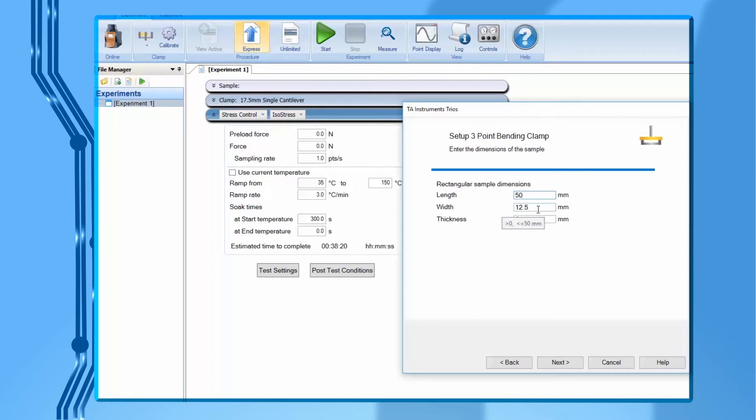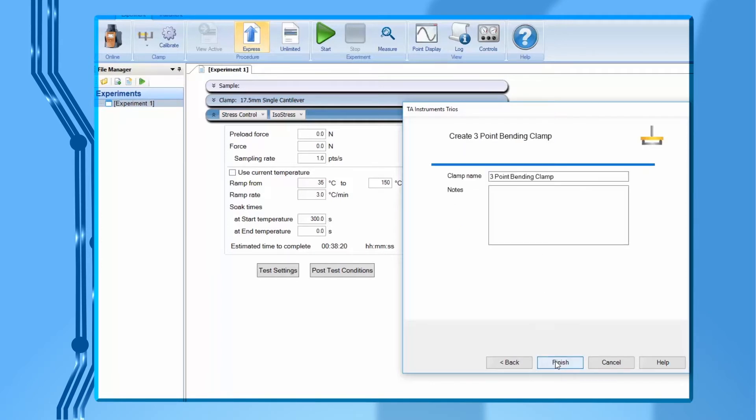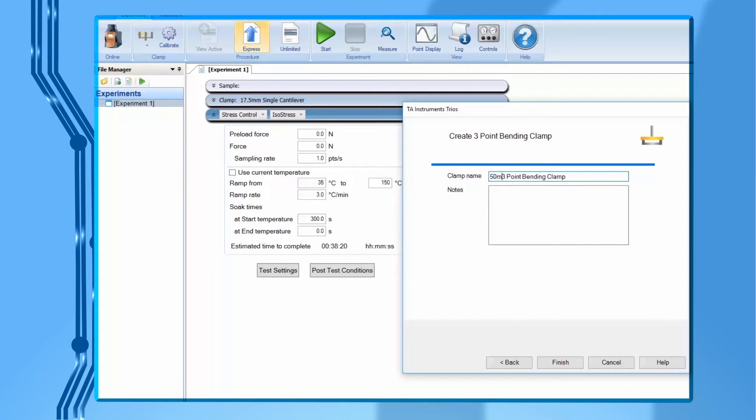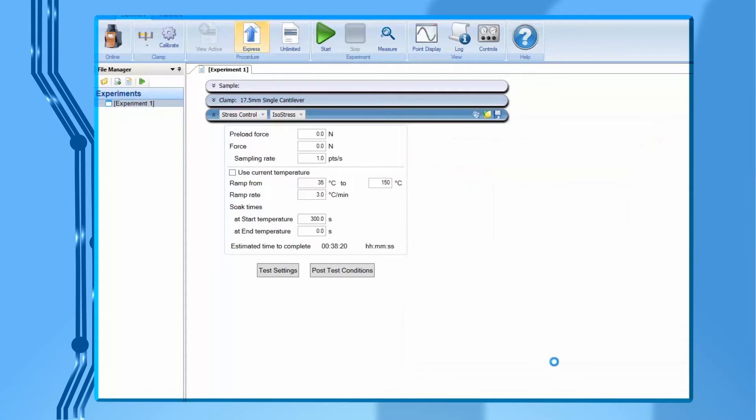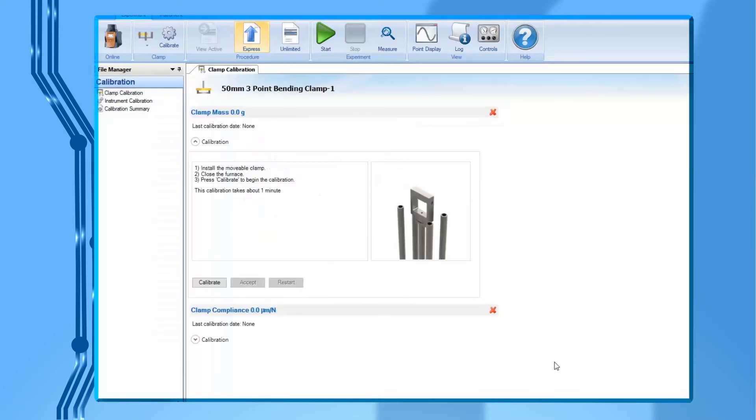So under sample size, enter 50 millimeter as the sample length. We can leave the width and thickness as default value for now since we'll be measuring and entering those values when we test each individual sample. Specify the name of the clamp by entering 50 millimeter three-point bending clamp. Click on finish to create this clamp file. Then TRIO's will automatically lead you to perform the clamp calibration.